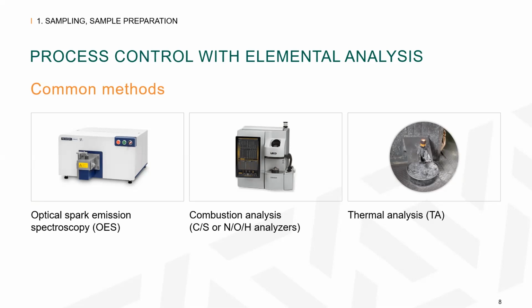Of the three methods, all three can analyze for carbon accurately, but OES provides the fastest and most reliable results at the lowest cost of ownership while maintaining low sample preparation.